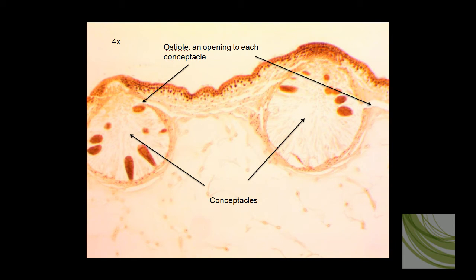Here is another slide that is a little bit better than the first slide. This is showing two female concepticles, and these openings, called osteoles, are very apparent, even using the 4X objective.